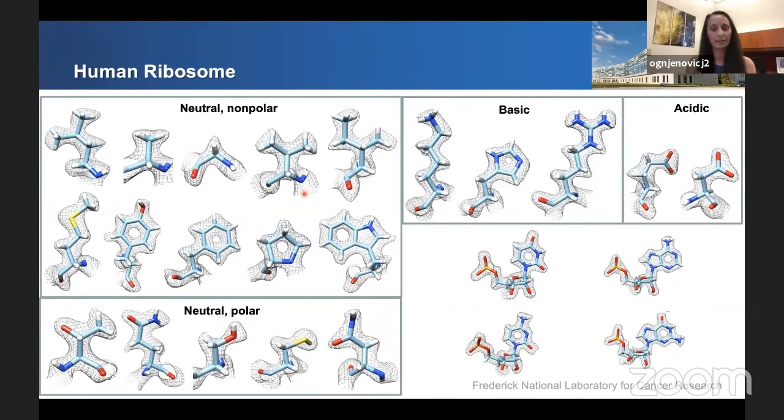And similarly, the bulkier density from the 3 gamma carbon hydrogens of the threonine makes fitting of this side chain pretty straightforward. And given that the sample is ribosome, next to the amino acid panel, here is an additional panel showing the density around the 4 standard nucleobases.